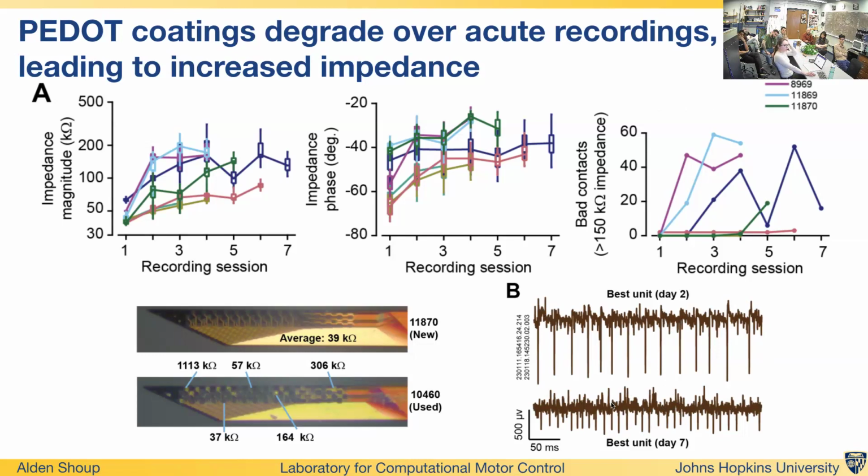And as you can see, if you're only getting units that are this much higher than the noise threshold, imagine all of the other units, or the lack of units, that you're able to record because of this change. And we were noticing over time that our number of units would reduce. This is something that we saw in our probes, but we were curious, do other people see this? Is this something that we're able to see on a larger scale?